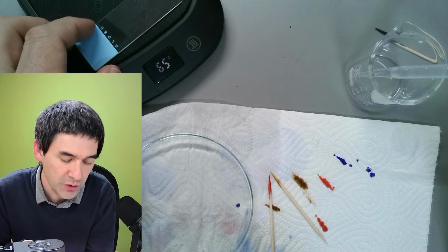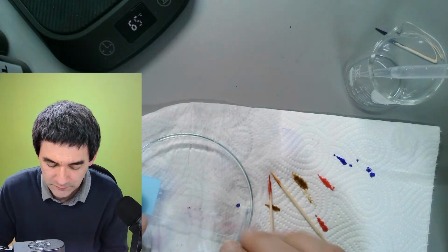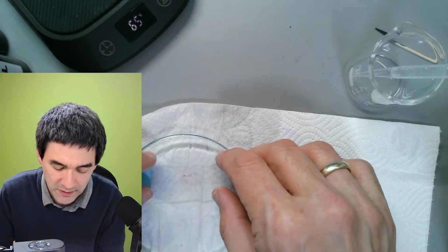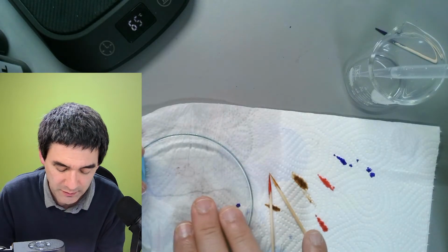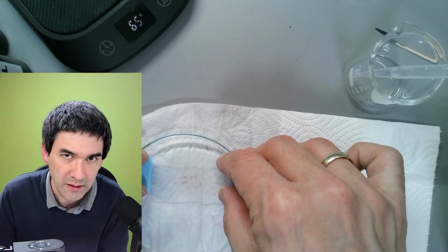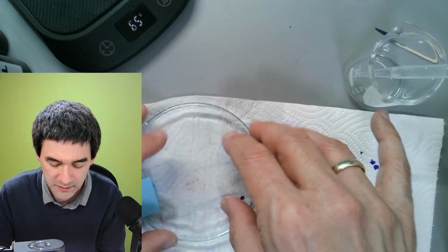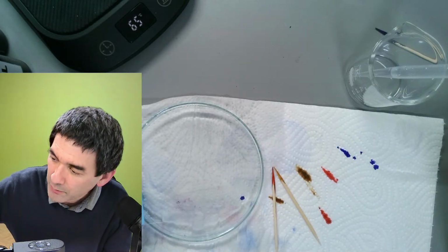Yes, it's finished now. I'm going to quickly cool it here again. Yeah, and this is going to be the actual real test of whether it worked or not. When I worked in the lab, I sometimes had to do these stainings and all the experiments over and over and over again, several times. Simply in the sciences, you always want to be able to repeat an experiment.